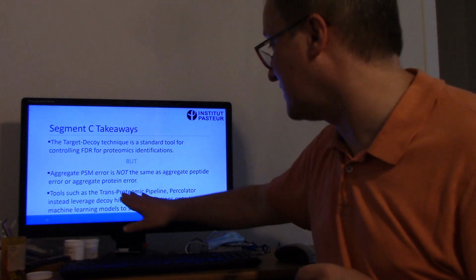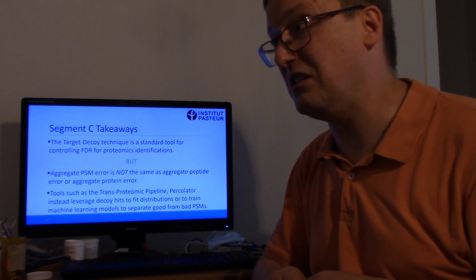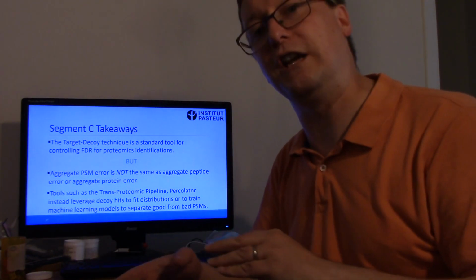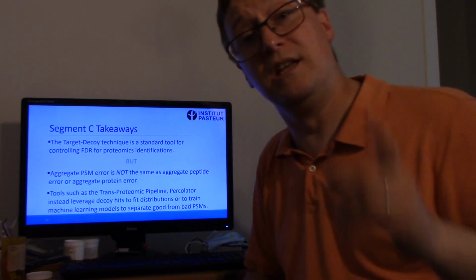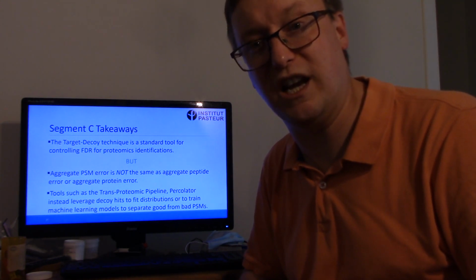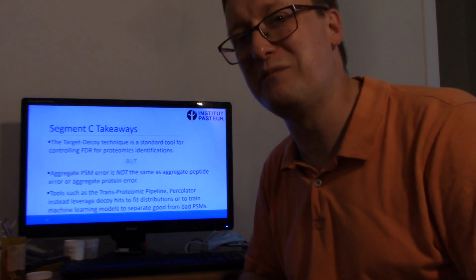But systems like the TPP and Percolator will instead do some sort of either a distribution-based analysis or a machine learning analysis to determine how to leverage that information about error. Okay, take a little break. When we come back, we will talk about protein identification, more accurately, protein inference. See you in a minute.